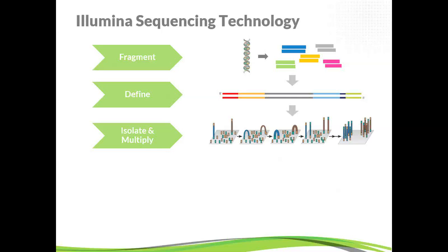In Illumina sequencing, this is done on a two-dimensional surface called a flow cell, and so the surface is populated with a bunch of small primers, which are complementary to the ends of these adapters. And through this process called cluster amplification, we generate for each individual unique fragment basically a little colony of fragments, or a little clonal population of fragments, which just helps to intensify the signal from that unique molecule during sequencing.